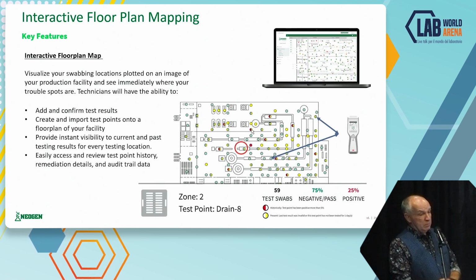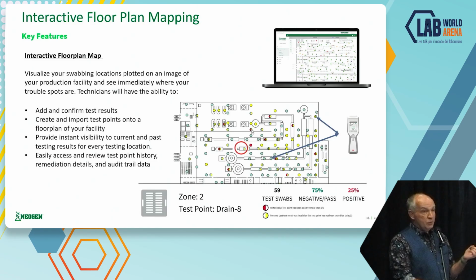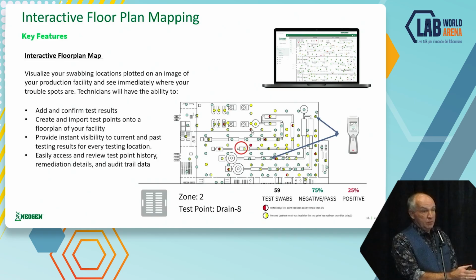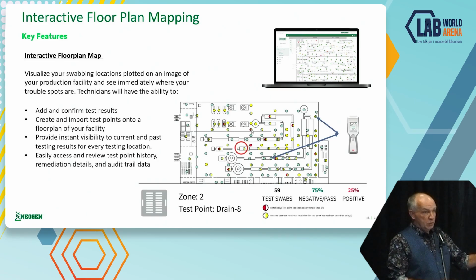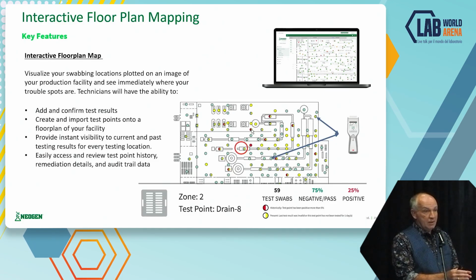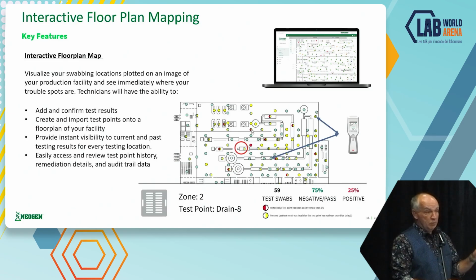By knowing, oh, we have cleaning failures in one area, then suddenly you start to see some pathogen data coming up. Oh, we have listeria results, we have salmonella results in the same area. You know what to do. You need to check your cleaning process. So in the past, we collected all the data and somebody had to review it and make a conclusion. The system is helping here because it makes it visual and you can see where you have some points where you really need to take care.